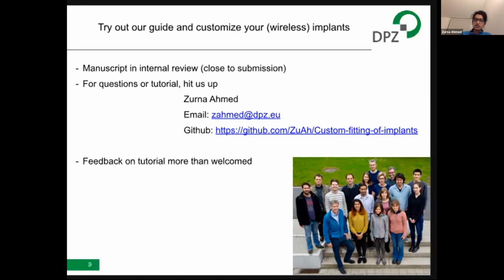With the single electrode recordings that I was showing before, with the round chamber and then the legs, there we put the legs, but there are also approaches where you can just use the cylinder itself and then put cement around it again. So it depends on which type of implant you're using.